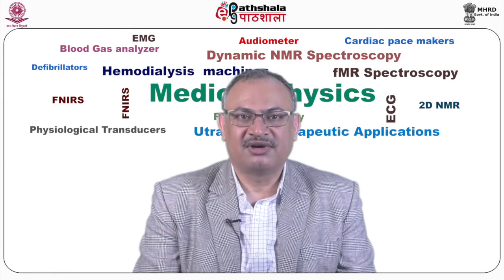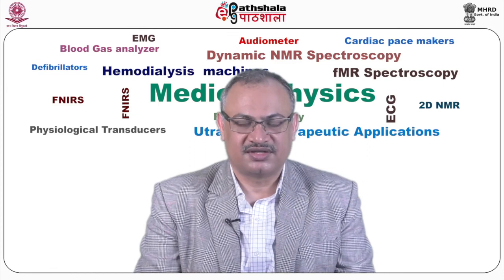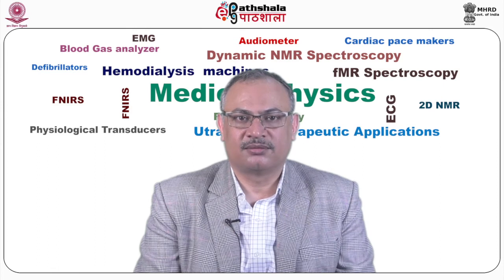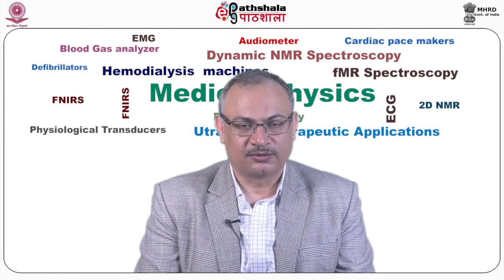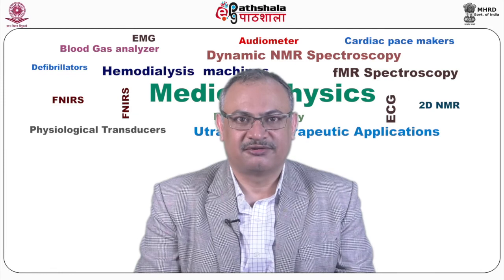Usually a mixing time of 100 to 150 millisecond is used for the generation of NOE. All protons in the vicinity of 5 angstrom of any amide proton are detected in terms of NOE cross peaks to that amide proton. The integrated intensities are converted into distance constraints by using various modules of the CYANA software.